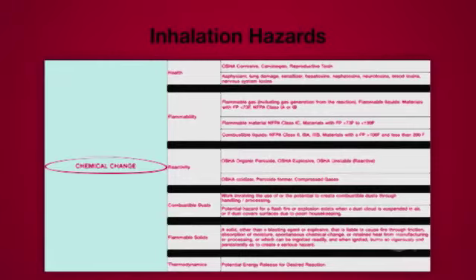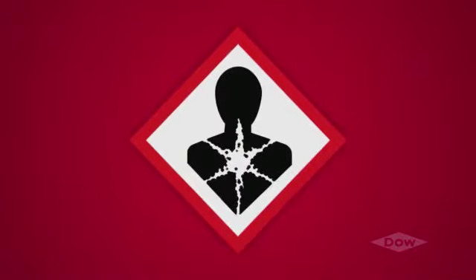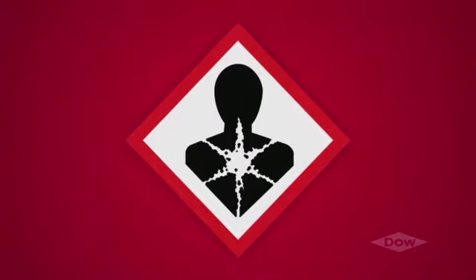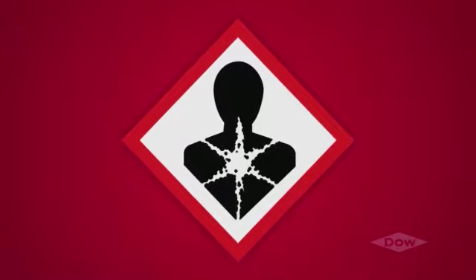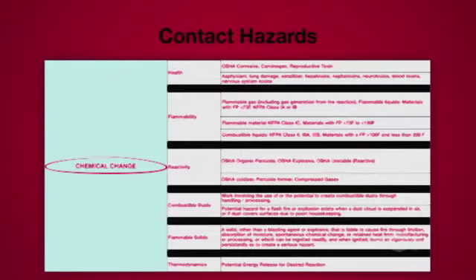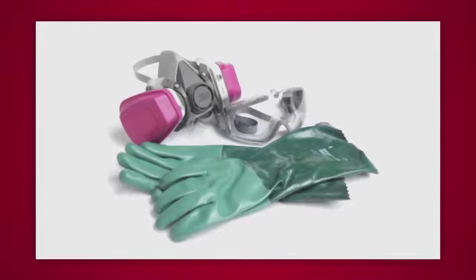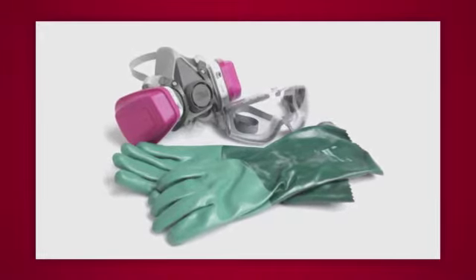For inhalation hazards, your project planning should focus on how to minimize the potential for vapors in your breathing zone. Use chemical fume hoods or local ventilation. Then verify that the ventilation works as designed. As for skin or eye contact, you must clearly identify the correct type of gloves and chemical worker goggles to wear if needed. Remember, if there is any splash potential, goggles are the eye protection of choice.